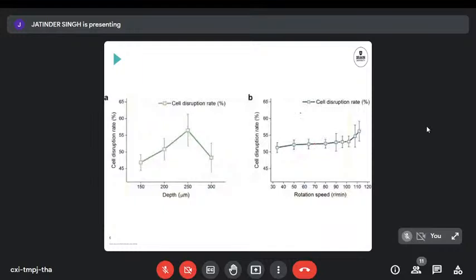Using the beads was reasonably effective. So about half of the cells got disrupted. And that could be improved to around 70-80% as described in the paper, when cells were exposed to the bullets coming down on a repeat basis. So not bad, a nice and simple engineered solution to lyse cells by just squashing them inside a microchannel so that they burst open and they release their contents ready for further processing.